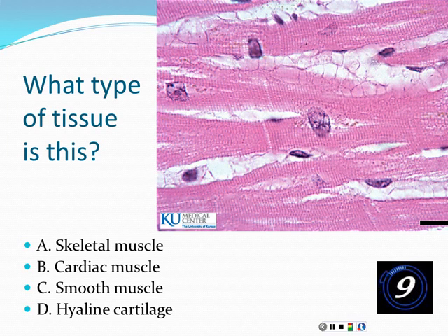All right, that's everybody. Very good. That is B. That's cardiac muscle. So how can you tell? Well, you see striations, right? You can see this kind of bumpy pattern here, and then these fibers branch. So branching fibers and striations, it has to be cardiac muscle.